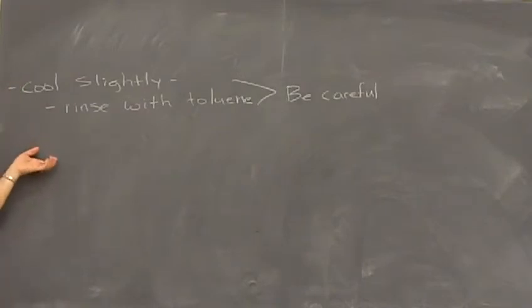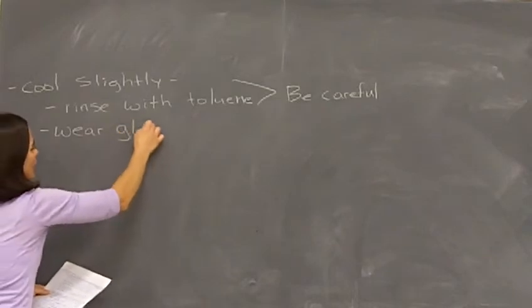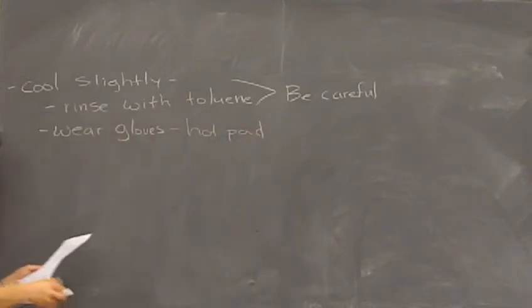If you let it cool down completely, what it forms is this polymer salty sludge, and you can't get it out of your apparatus. Like your apparatus won't be able to be used anymore, okay? So that's why you want to get it out while it's hot, but you can handle it, so let it cool just a little bit, get everything out of there, but again, use caution doing that, okay? And definitely, through all this, make sure you're wearing gloves, and use your hot pad handling glassware so you don't burn yourself, okay?